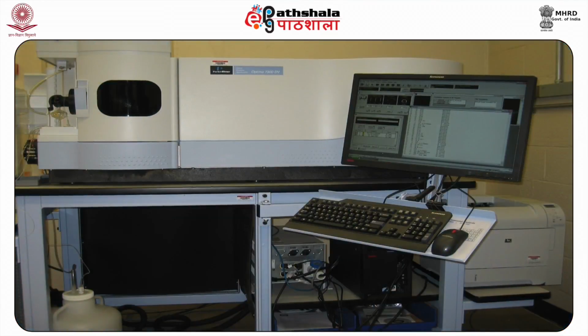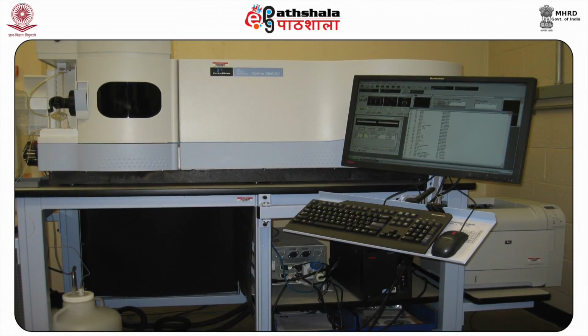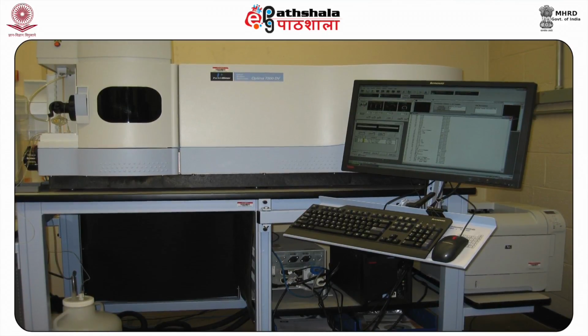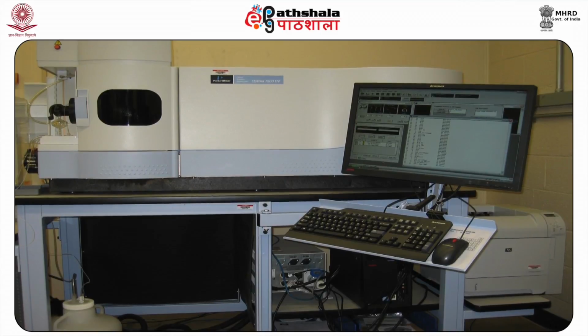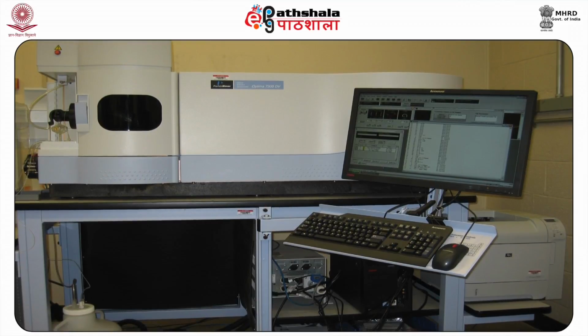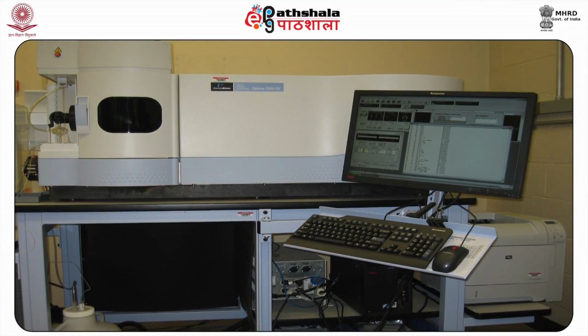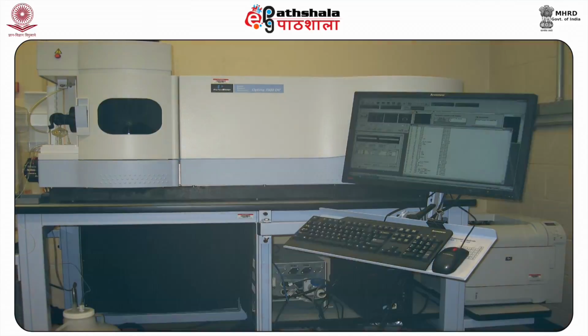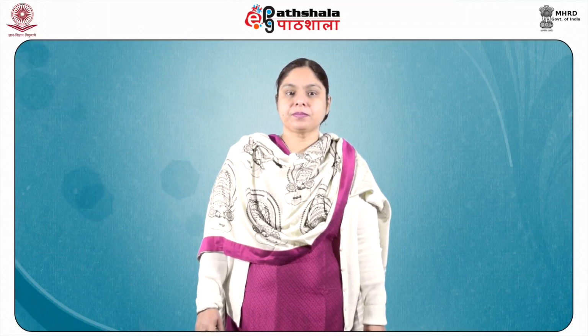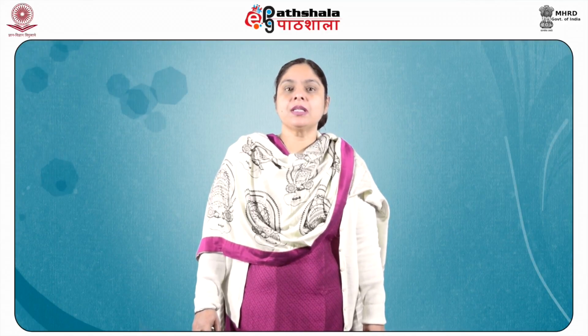In some designs, nitrogen gas or compressed air is used to cut the plasma at a specific spot, and transfer lenses are used to focus the emitted light on a diffraction grating, which separates the light into its component wavelengths in an optical spectrometer. While in some designs, the plasma is directly impinged upon an optical interface. After the light separates into different wavelengths or colors, the light intensity is measured by photomultiplier tubes, which are carefully positioned to view the specific wavelengths for each element line involved.